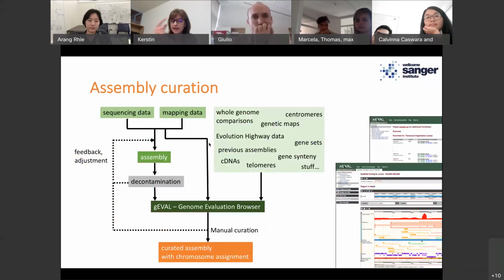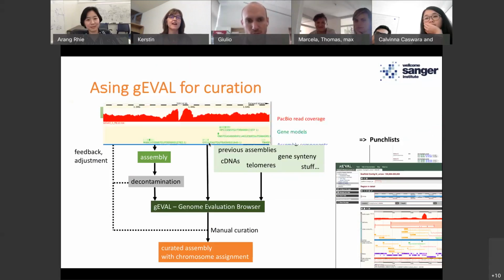Maybe I should say here, we had assemblies before that we actually had to send back because they were in not a good enough state to be curated. If I remember correctly, apart from the one assembly that had the wrong SMRT cells in it, these were all assemblies that had too many haplotype extensions, so duplications created by not removing or resolving the haplotypes correctly. So if we send an assembly back to you guys, don't be disappointed. That won't be the first, and that is a totally normal issue, and yeah, it can happen.